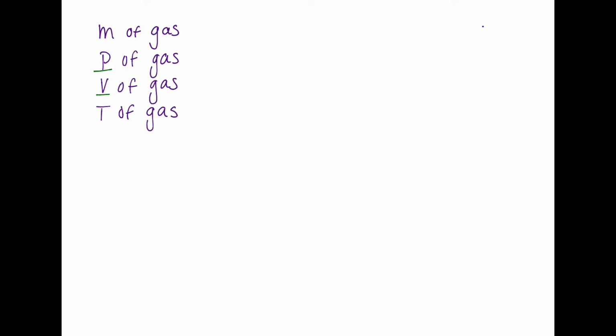The temperature is our next one. Temperature is going to be relatively easy. The temperature of the gas is going to be the same as room temperature. So as long as we take the temperature of the room, we'll have the temperature of our gas.